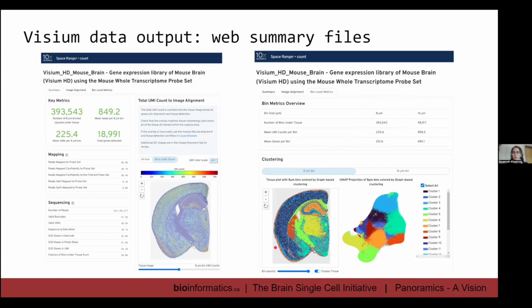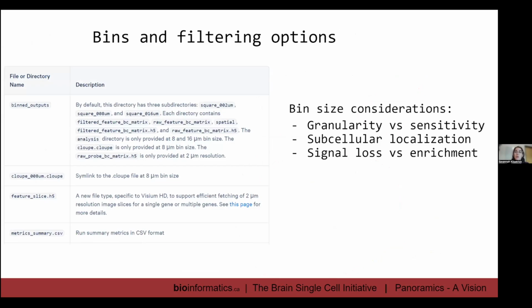Below, I wouldn't put too much focus on the clustering that 10x will perform. I'm not really sure what pipeline they use. It could be very similar to the Seurat pipeline that we'll be using today, but in general, we can just look at our own data. It'd be more exciting.